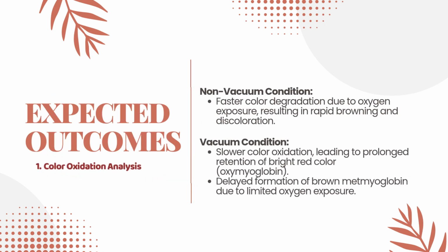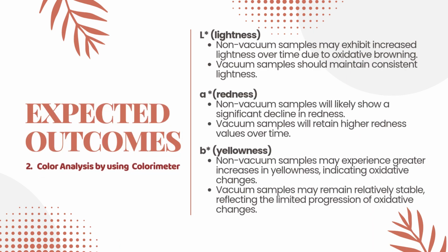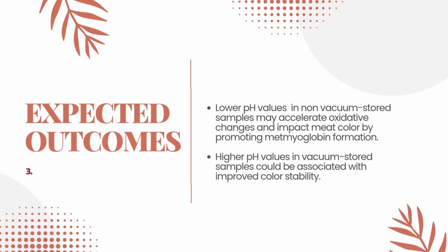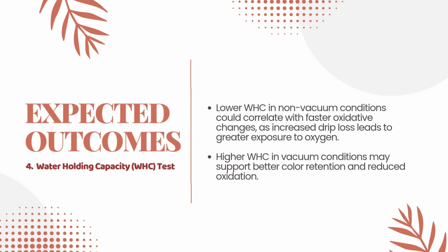Expected outcome in color oxidation analysis. Expected outcome in color analysis using colorimeter. Expected outcome in pH analysis. Expected outcome in water holding capacity test.